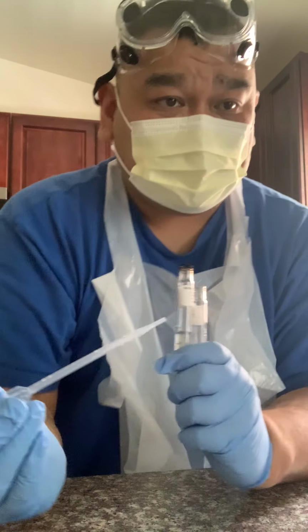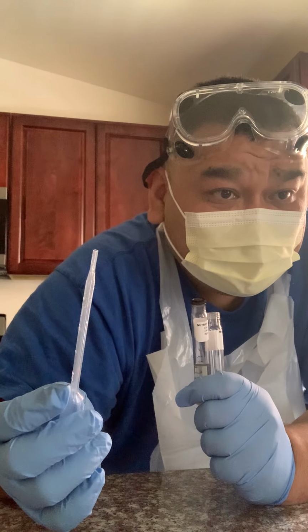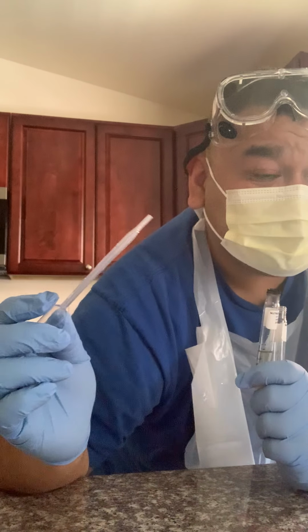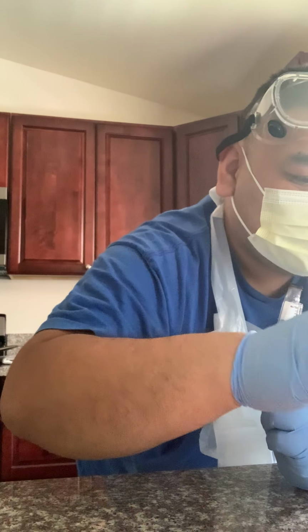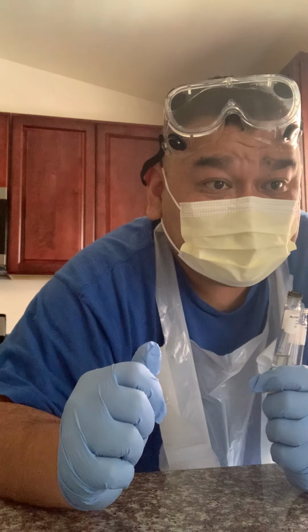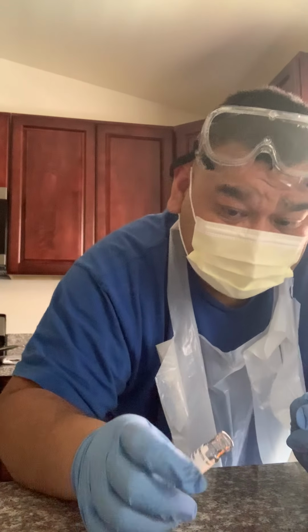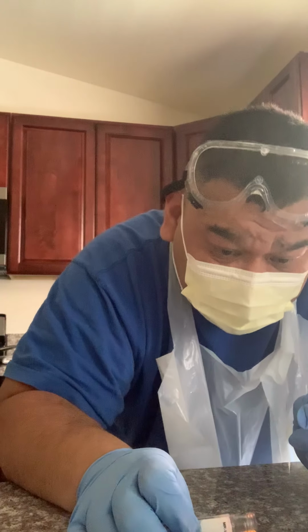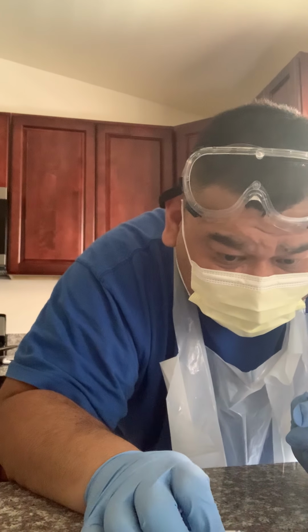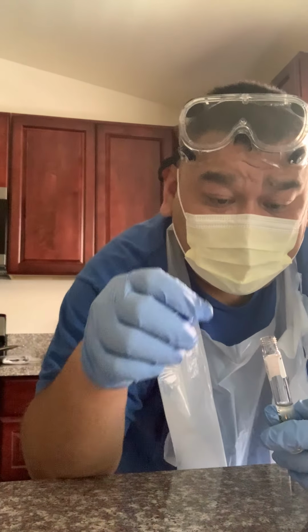All right, that's four drops in there. Place that pipette in undiluted bleach. Okay, we'll leave that there for a moment. Flame the lip of the inoculated MRVP broth, and screw on the cap.